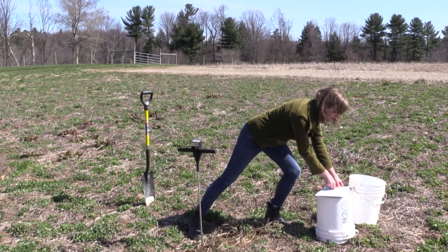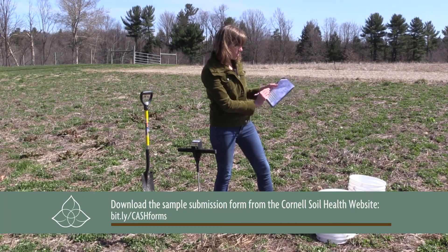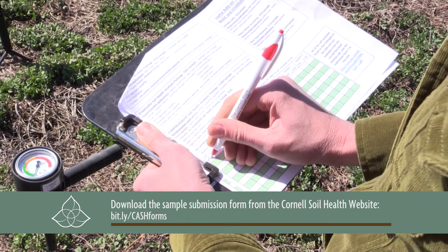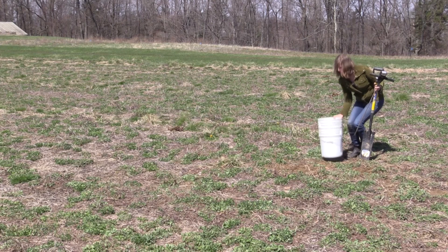I'm going to go ahead and take the back of the submission form. In this case, this is location one — 0 to 6 was 150 PSI and 6 to 18 was 400 PSI. And then we're ready to move to our next location.